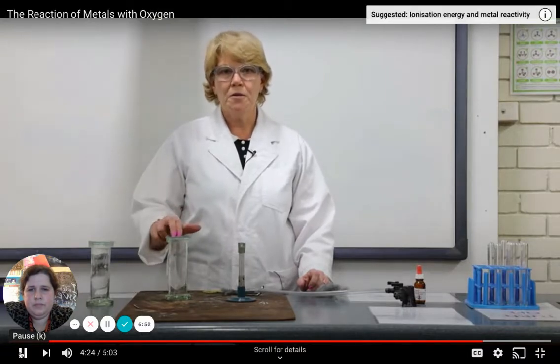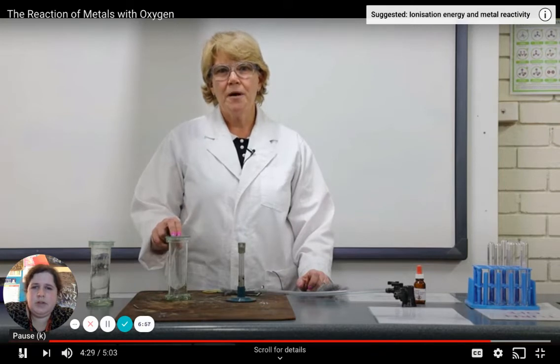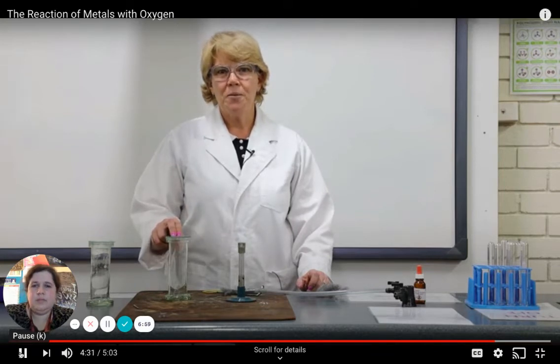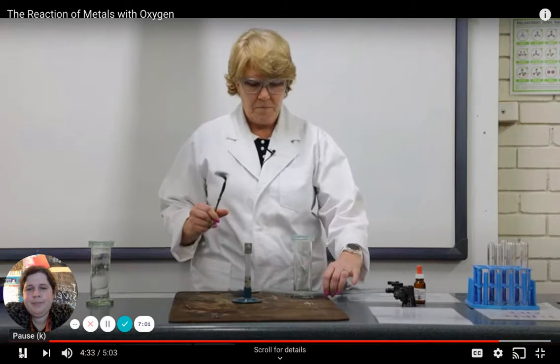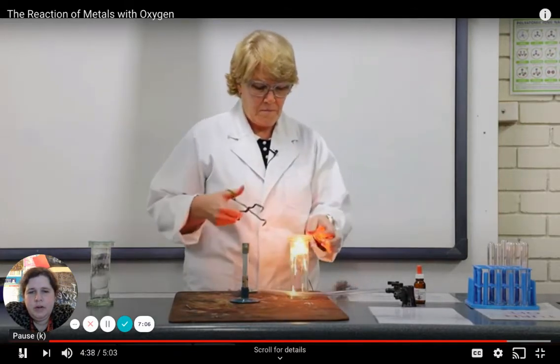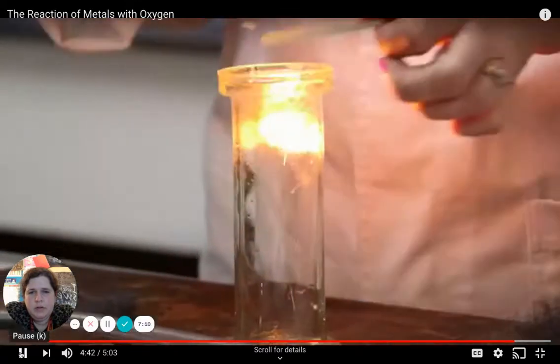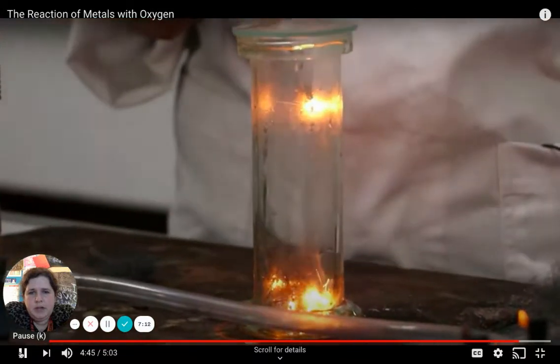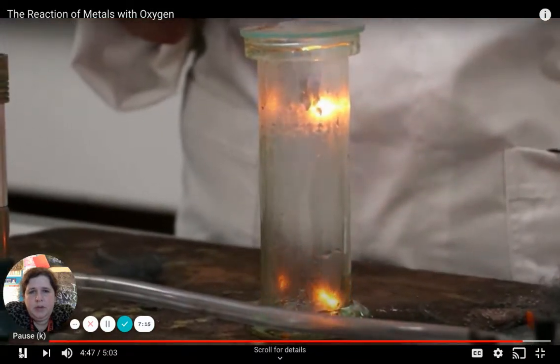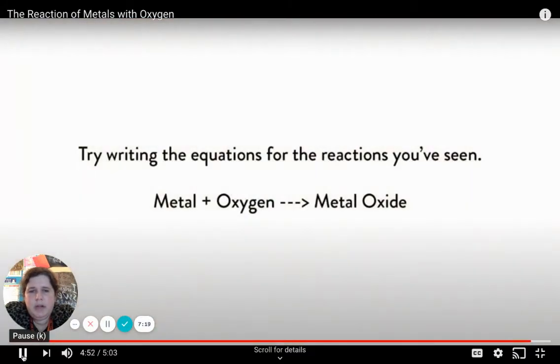We're now going to see how steel wool burns in pure oxygen. Well, really it's just air enriched with some extra oxygen. So we're upping the oxygen content. It should be enough to really support the combustion. Okay, so she lit it on fire. Now she's putting it in a lot of oxygen and covering it up so it traps all the gas in there. And we can see it is sparking quite a bit, at least to start. And eventually it uses up the oxygen.